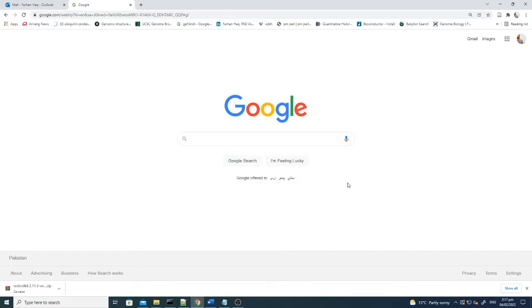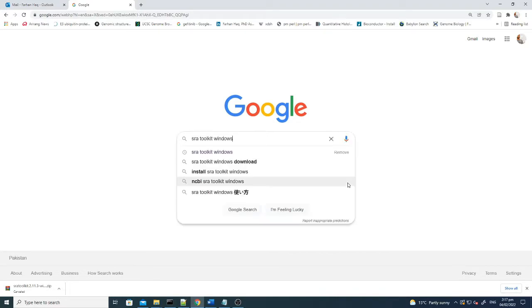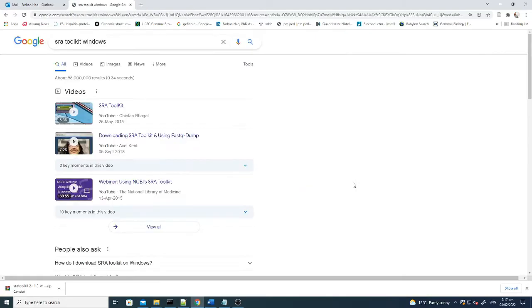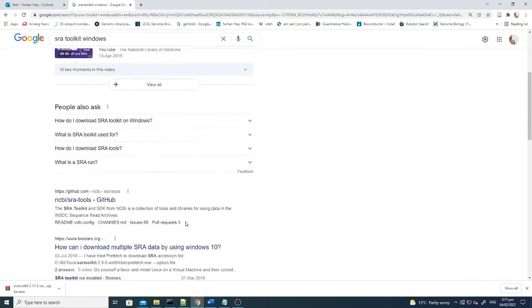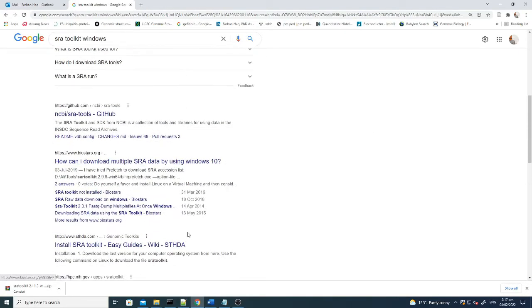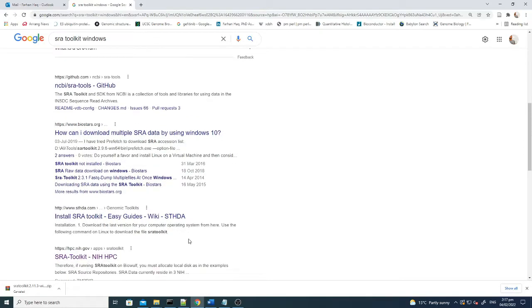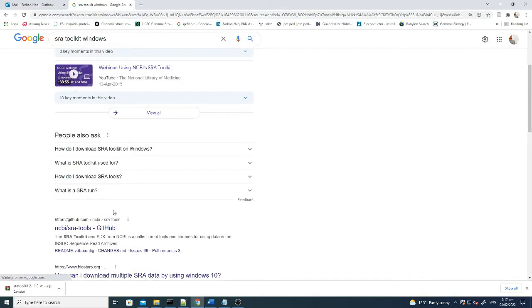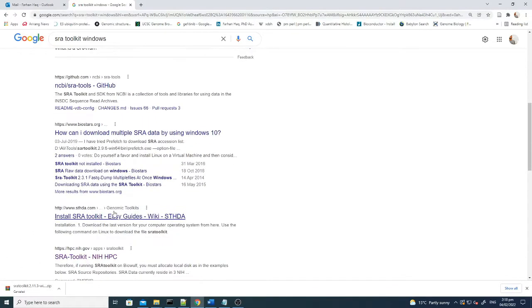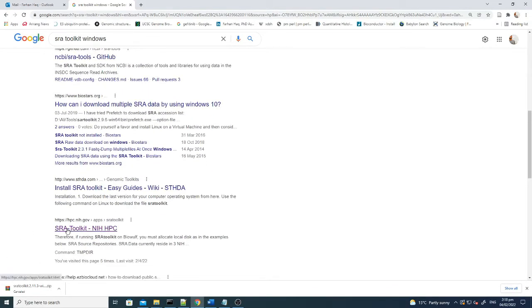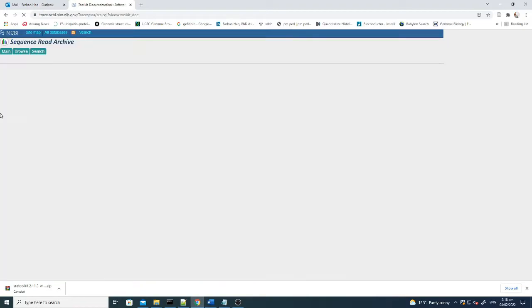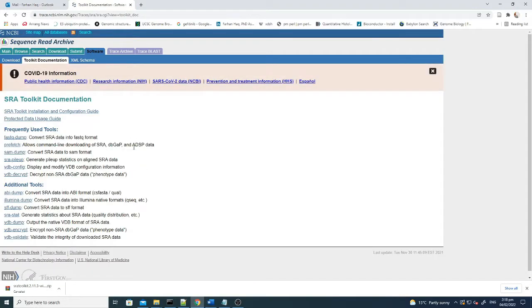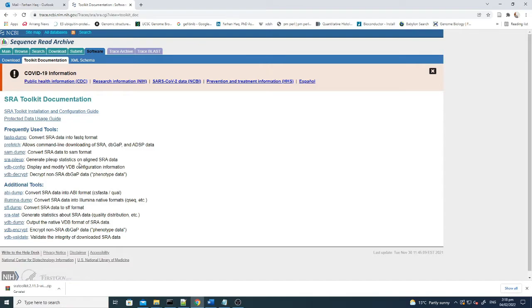The first thing is that you need an SRA toolkit. This SRA toolkit is actually to download the sequencing data. Here you can see the SRA toolkit from NIH. This is all the information, and from here you can go to the SRA toolkit documentation. These are the major files which you will be using to download, access, or convert the SRA files into your file of interest.